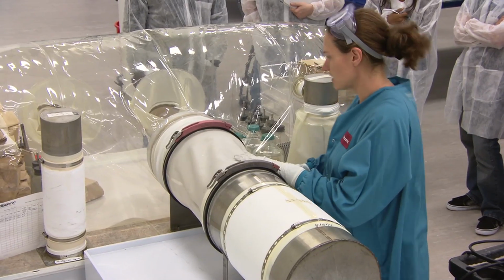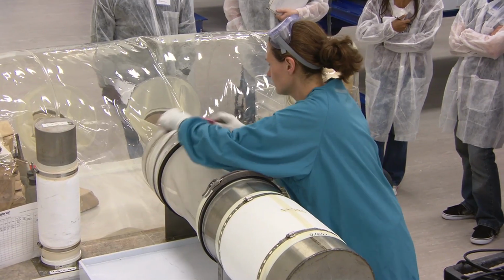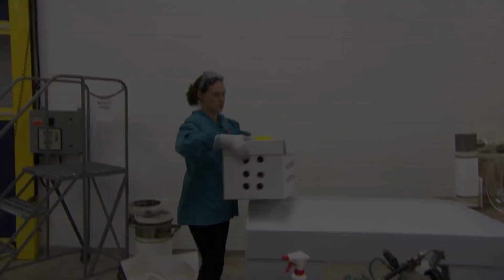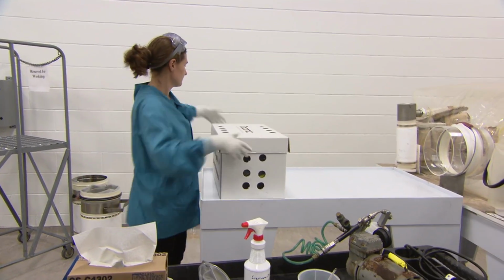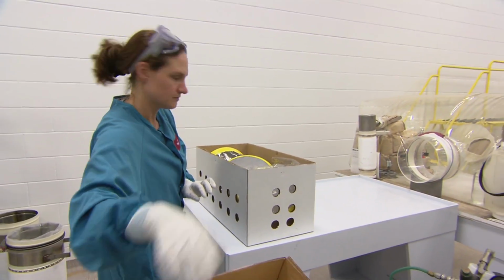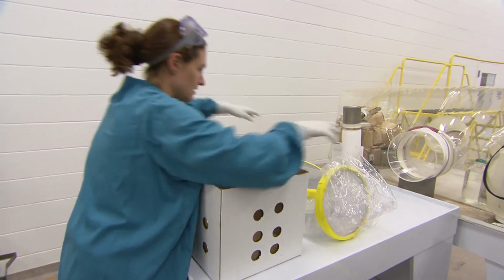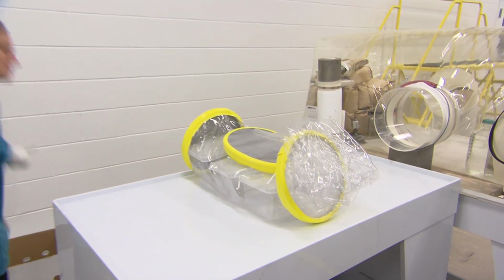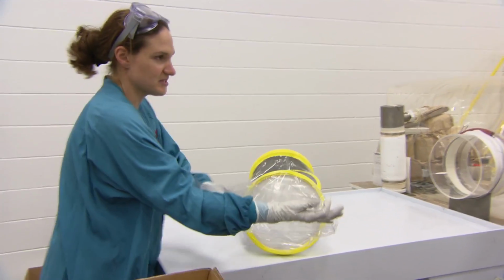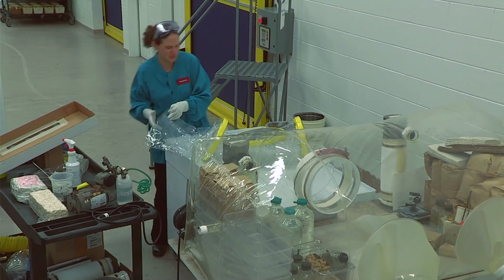So I'm just going to unhook this, and then we're going to hook up a germ-free shipper. Okay, now we have our germ-free shipper. So normally the shipper, when it arrives to you, this end has been sterilized, and this is taped up and kind of placed up there. So this, I already removed the tape.